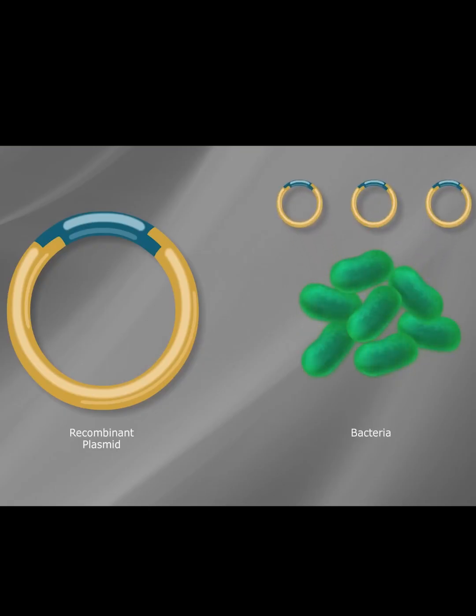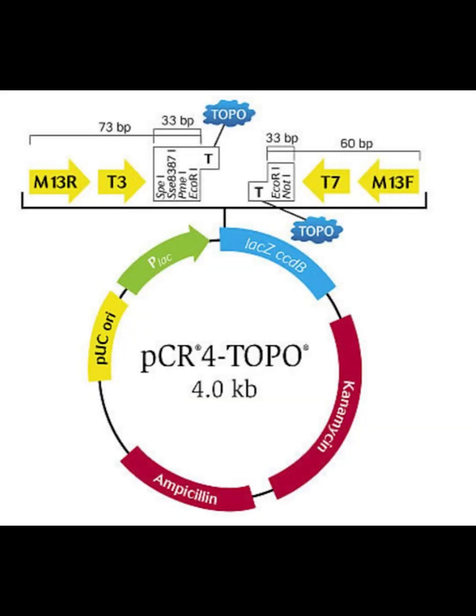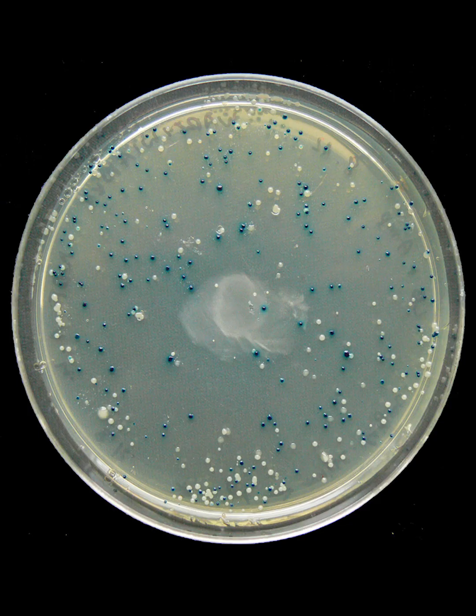Selection is done on ampicillin and X-gal plates. Ampicillin is a normal antibiotic selection mechanism where only cells with our recombinant DNA will survive, while regarding X-gal, if the plasmid did not receive our insert, the LacZ gene remains intact. The colonies turn blue when they metabolize X-gal. If the plasmid does contain our insert, the insert disrupts LacZ, preventing beta-galactosidase production, and then the colonies remain white.